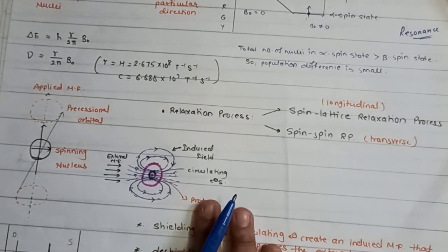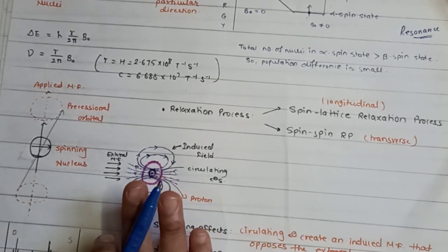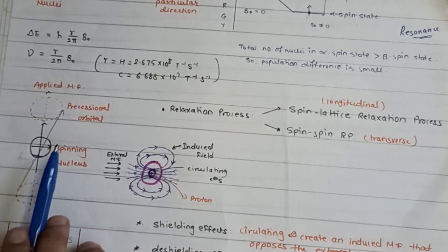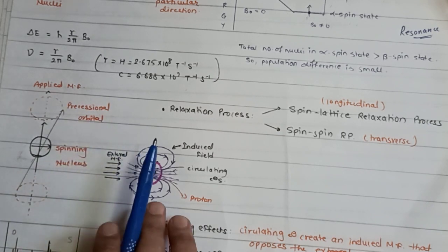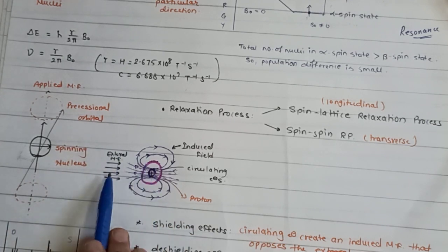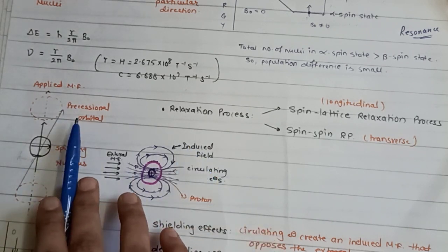It is very important to know that the spinning frequency जो है यहाँ पर, ठीक है, of the nucleus doesn't change, बट द प्रिसेशनल, मतलब ये जो फ्रीक्वेंसी ये तो यहाँ पे चेंज नहीं हो रही, but the precessional frequency, ओके, that can be changed because the precessional frequency जो होती है यहाँ पर that is directly proportional to your applied magnetic field. So the stronger the applied magnetic field, the higher the precessional rate.